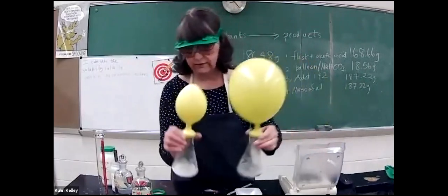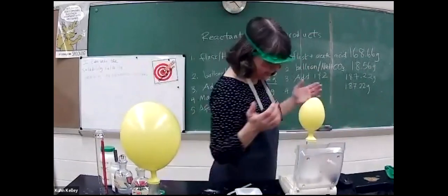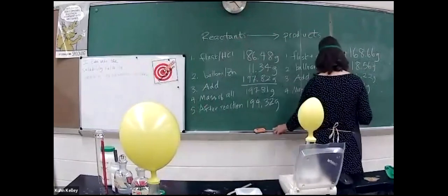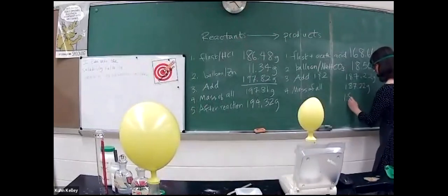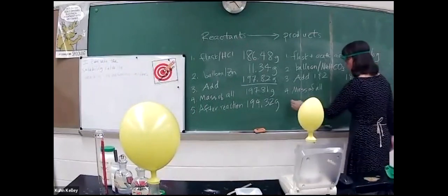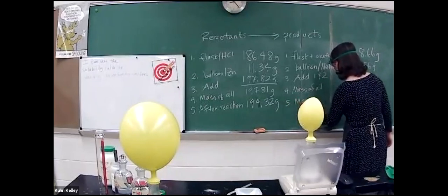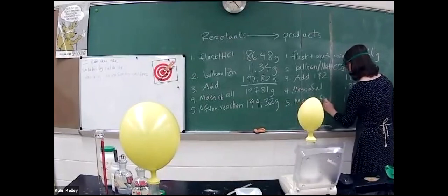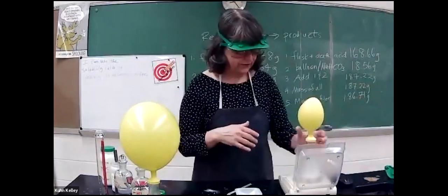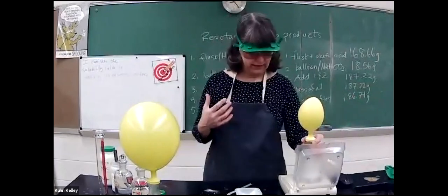And this one after weighs 186.71. So do make sure that you have all of these masses in your data table. You can rewind and get those if you didn't. Once again, this was after it was 186.71.